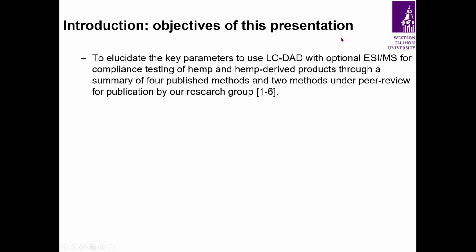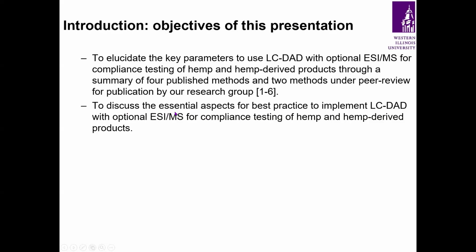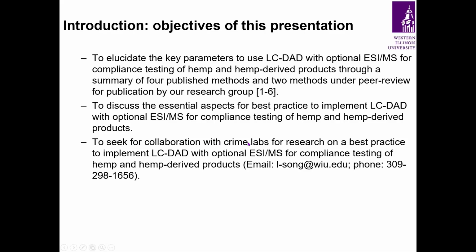The objectives of this presentation are to elucidate the key factors to use LC-DAD with optional ESI-MS for compliance testing of hemp and hemp-derived products through a summary of 4 published methods and 2 methods under peer review for publication by our research group; to discuss the essential aspects for best practice to implement LC-DAD with optional ESI-MS for compliance testing; and to seek collaboration with crime labs for research on a best practice. Here is the contact information.